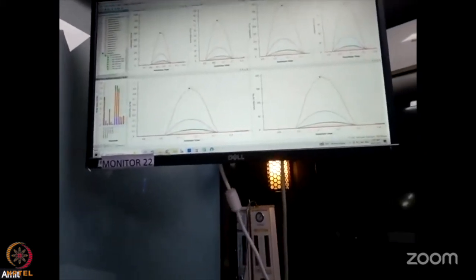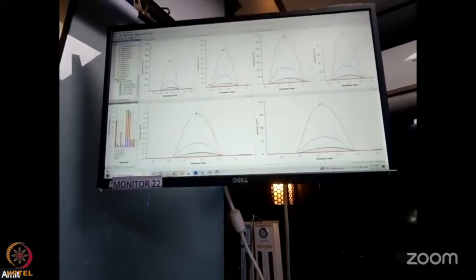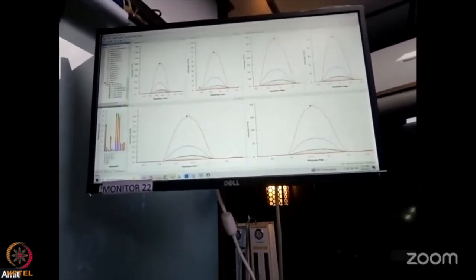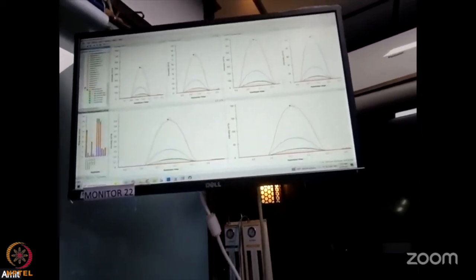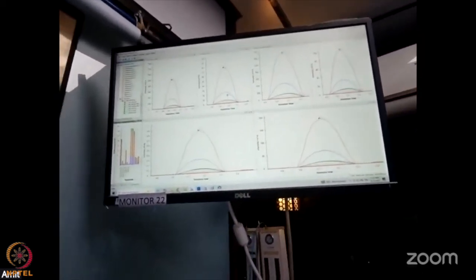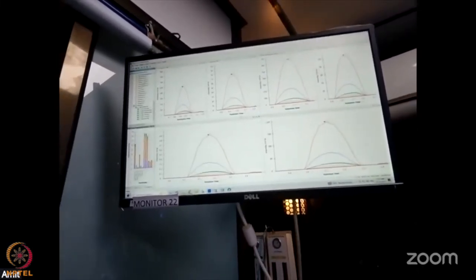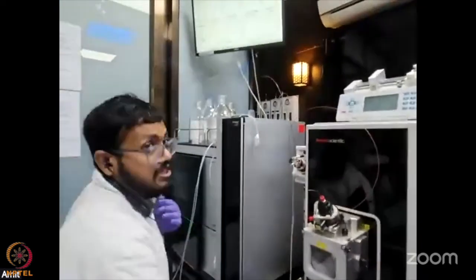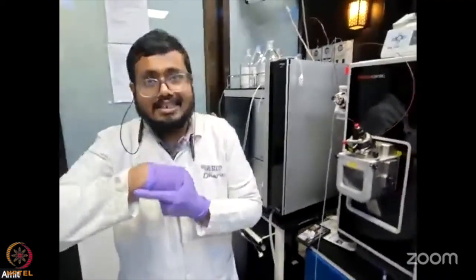At this retention time you have to check whether there is a retention time shift or not. Sam was also mentioning different kinds of QC checks using IRT peptides or standard metabolites. And this is the intensity, the peak observed under the area. Since this gives you the areas of all these transitions, it gives us the quantification, the actual intensity.